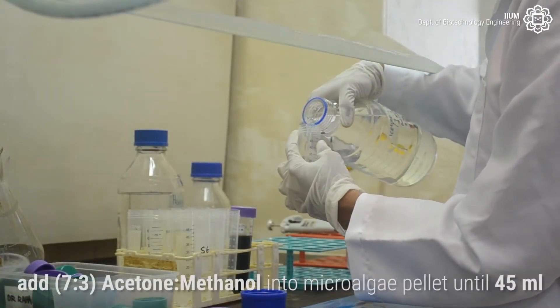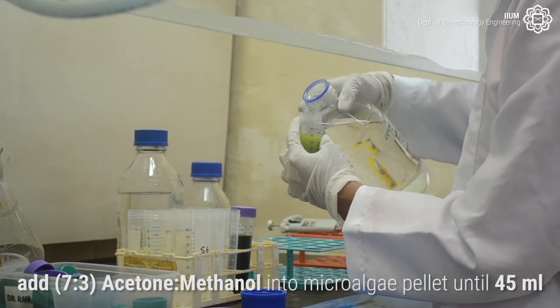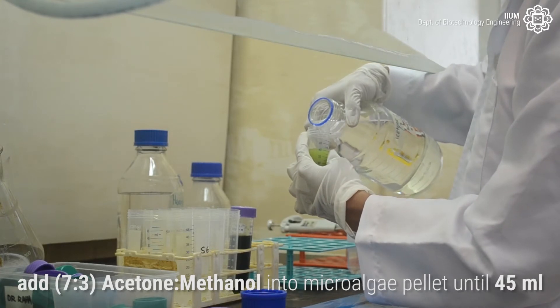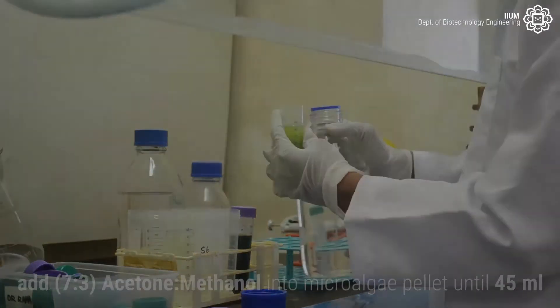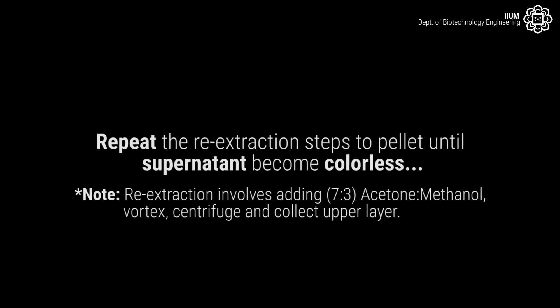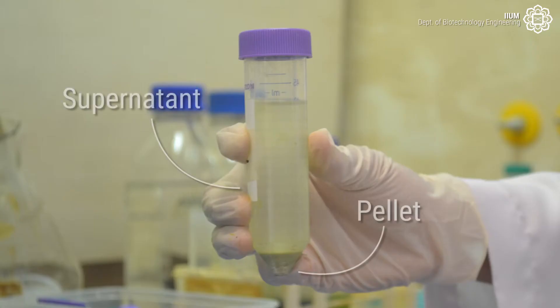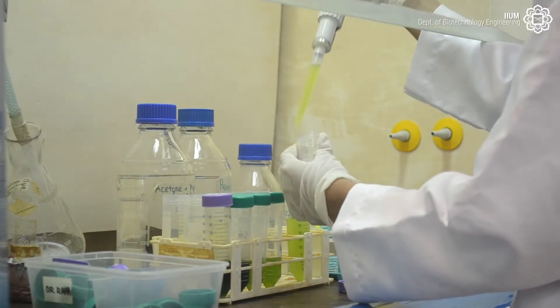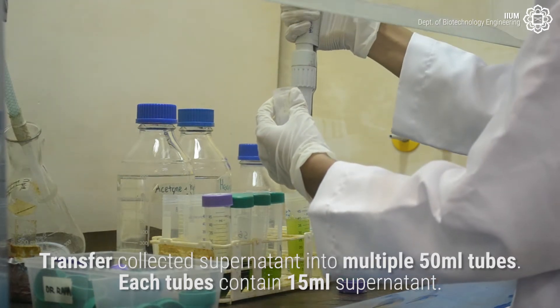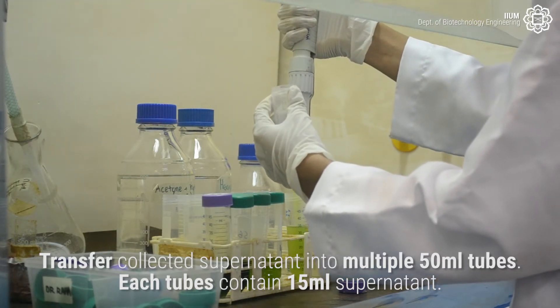Add 7:3 Acetone Methanol into the microalgae pellet until 45 ml. Repeat the re-extraction steps on the pellet until the supernatant becomes colorless. Each tube should contain 15 ml of supernatant.